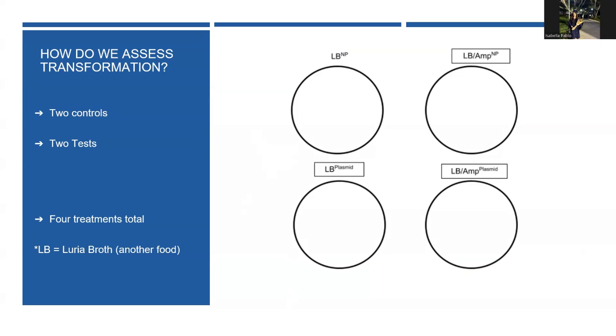All right. So if the plates had no LB, there would be no growth at all. We had 2 plates that were LB and then 2 plates that had that LB and, on top of that, were also infused with ampicillin. What we normally see is a plate with ampicillin will kill off E. coli completely because E. coli is killed off by ampicillin. However, when we give E. coli that pUC18 plasmid, it should be able to fight against that ampicillin that's infused into the plate.